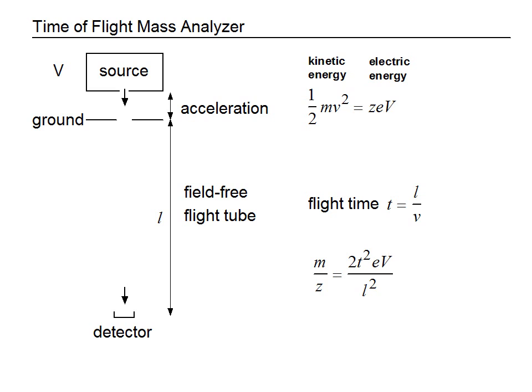Sorry, rather the other way around. We can replace the velocity up there by flight time t. So if we put v equals L divided by t, and we resolve this equation to the mass to charge ratio, then we will see it is related to the square of the flight time. The elemental charge, the voltage which was set on the instrument, and the length of the flight tube are all constants. So mass to charge is proportional to the square of the flight time.